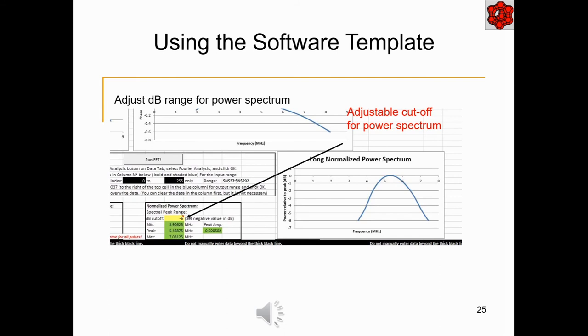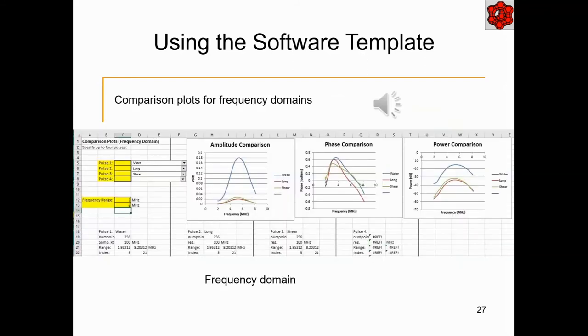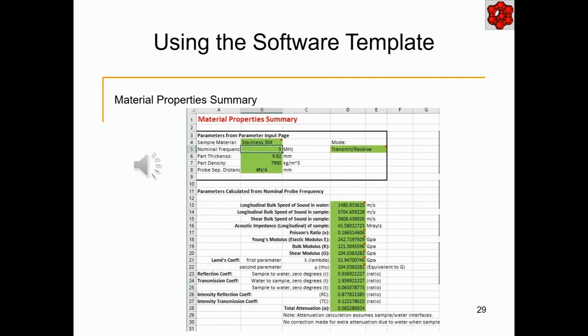The default for the attenuation analysis of the normalized power spectrum is set to minus 6 dB. However, this can be adjusted by the user and it applies to the plot only, not to the computations, so you can adjust it after the FFT is calculated. When the computation is completed, you get three new plots on the spectrum page. Moving to the time domain and frequency domain comparison tabs, you can now select pulses to compare their characteristics in a selected range of time or frequency. You view the plot comparisons in their separate worksheets.